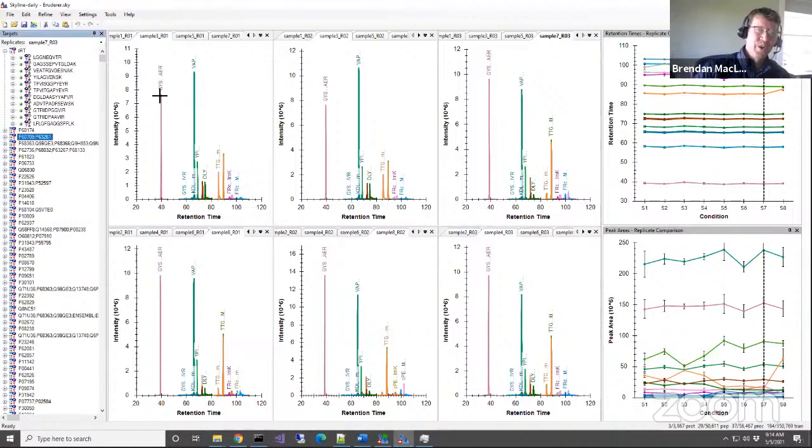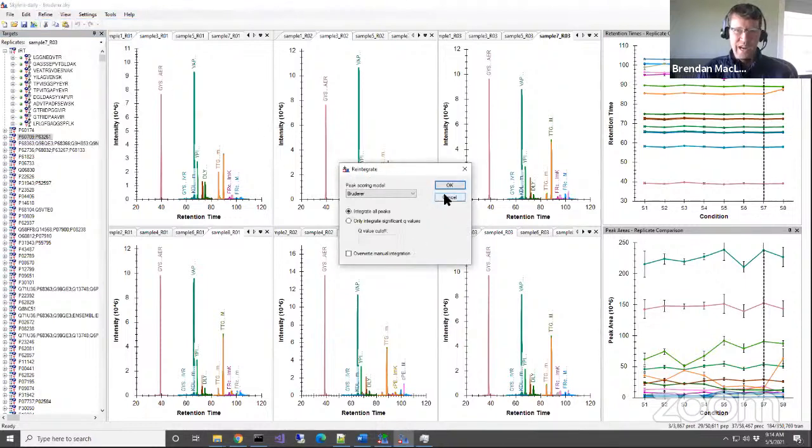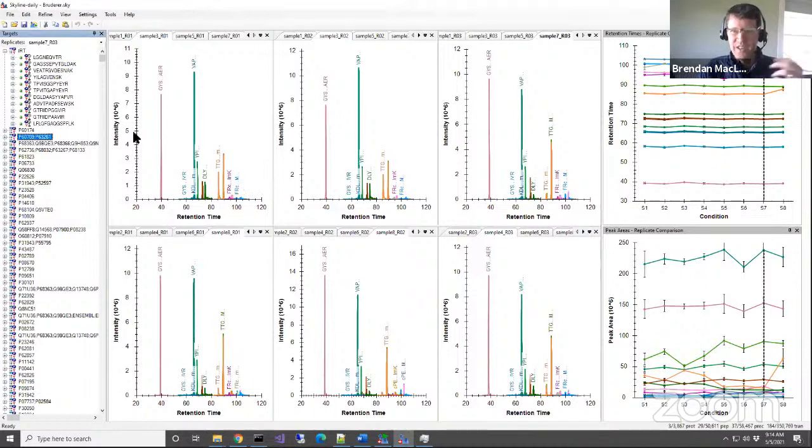So now we're going over things that you can do to assess the health of the processing that Skyline did. One is to look at the model. You definitely want to be confident about that. If you're missing any scores, sometimes you might come up and do that reintegrate and find that some scores are grayed out, and then that requires investigation. That's explained in one of the tutorials.